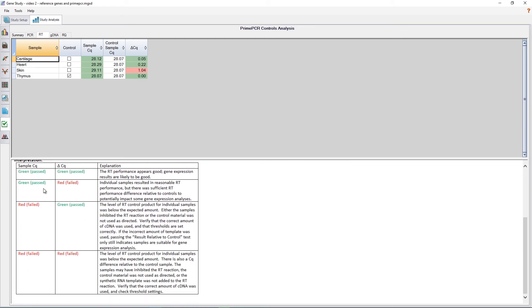We have now explored how to use the Reference Gene Selection Tool and the PrimePCR Controls Analysis Tool in CFX Maestro software. These tools are just two of the powerful features in CFX Maestro designed to help you get more reproducible results and data from your real-time PCR experiments. We hope you find these tools useful and wish you success in your real-time PCR experiments.